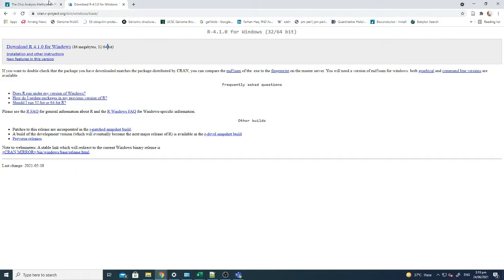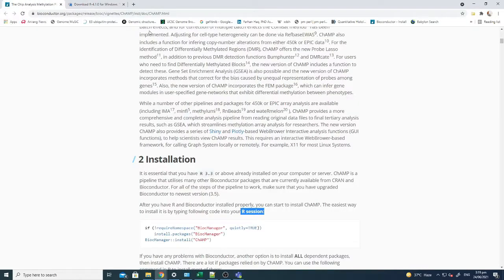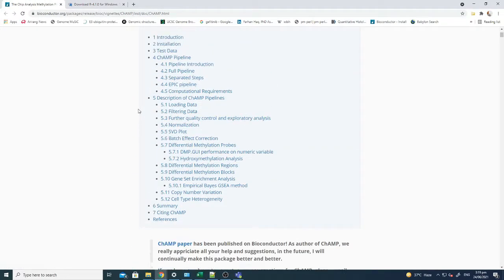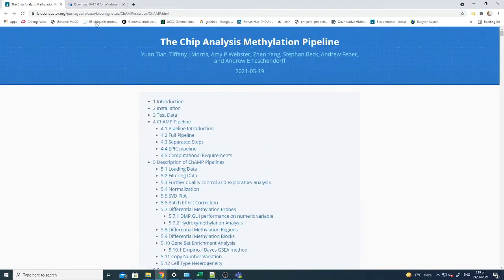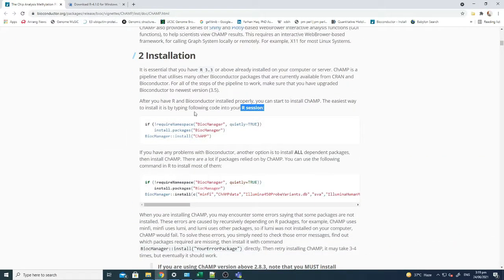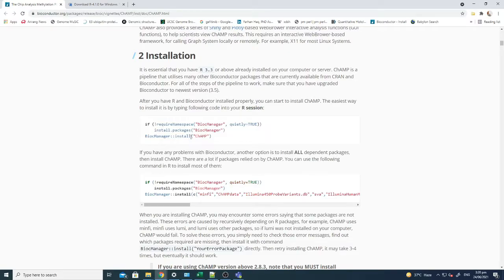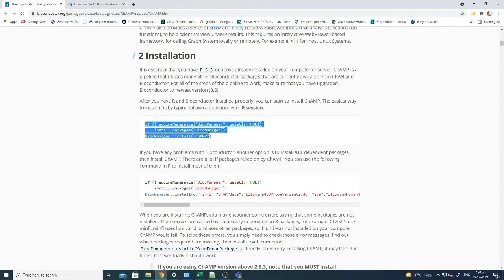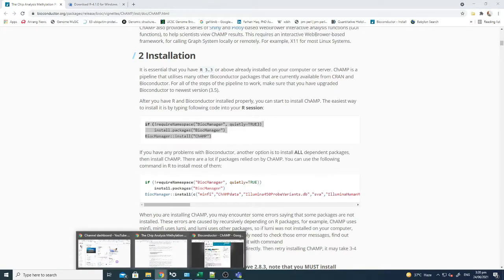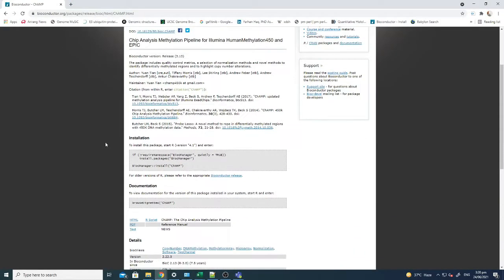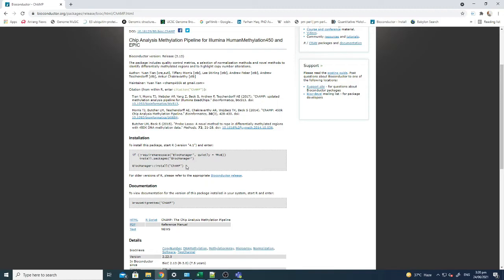After that, you have to go to the Bioconductor website, and from there you can find this command. This command actually contains the install CHAMP option, and this will directly start installing on your R software. So if you want to go on the Bioconductor website, here you can see this is the Bioconductor website from where you can download it. It's the same command, so this command will start downloading CHAMP on your computer.